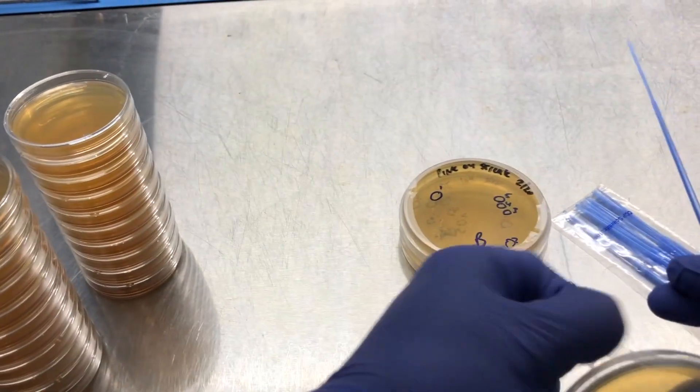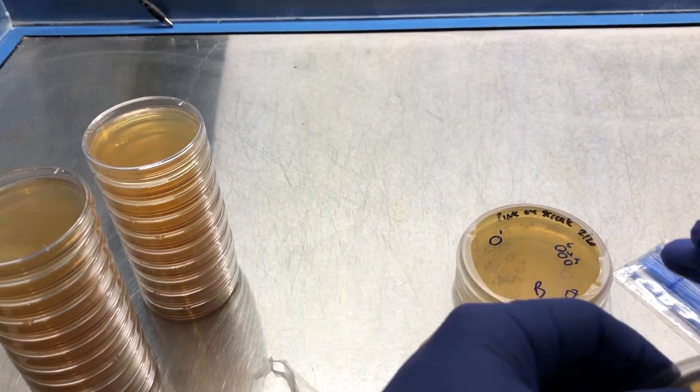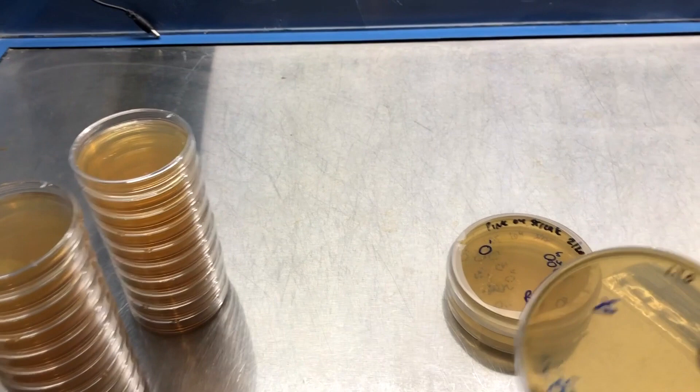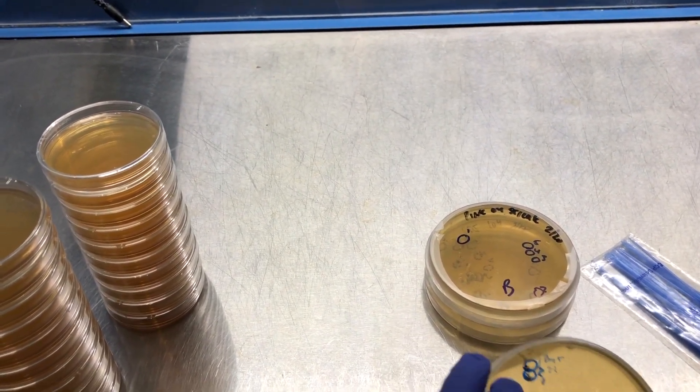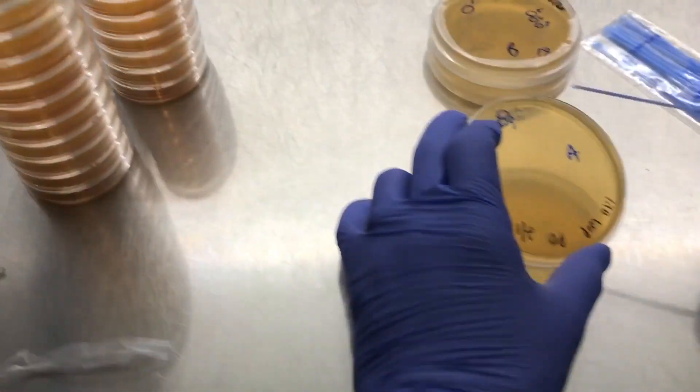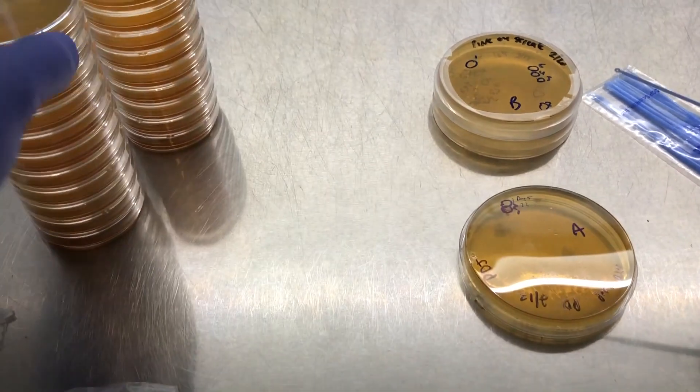So first thing you want to do is take off your parafilm and number one is the one that is closer to the middle. So the number one colony is going to be closer to the middle, that's what I'm going to be isolating first.